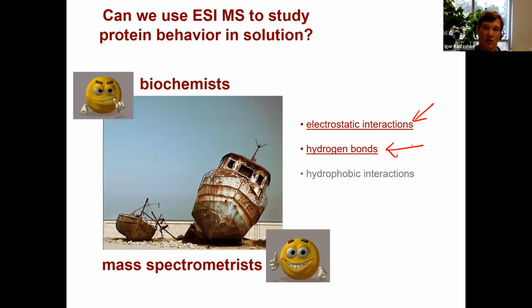So the only thing that you are definitely losing when you go to the vacuum is the hydrophobic interactions. By the very definition, once water disappears, there is no hydrophobic interaction anymore, right? There would be very weak van der Waals interaction, and that's it. And so this is important. These 3 lines are important to consider when you are weighing pros and cons of making certain measurements in the gas phase.